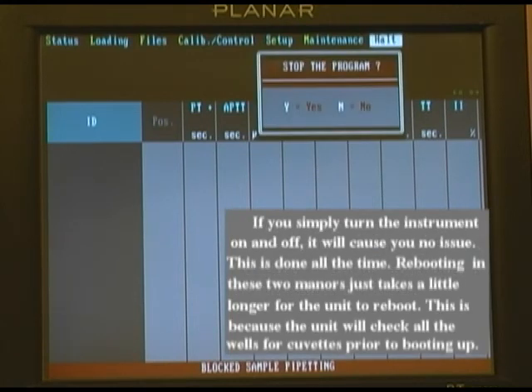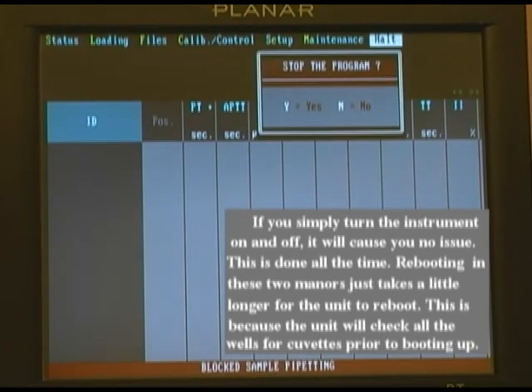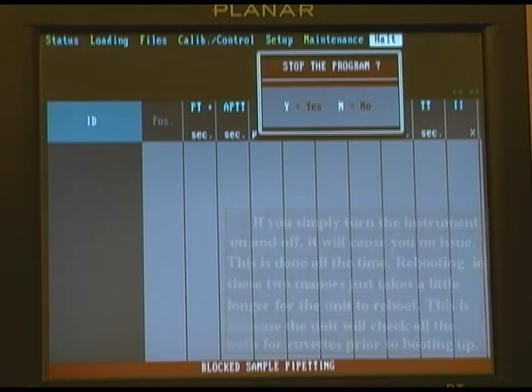press Enter to stop the program, type in Y for yes or N for no to exit. That will safely shut the instrument down without causing harm to your instrument or to your data.